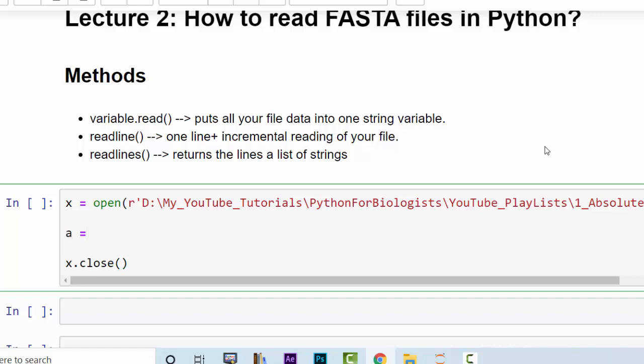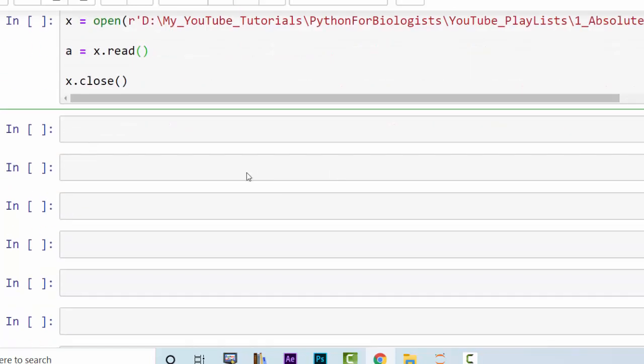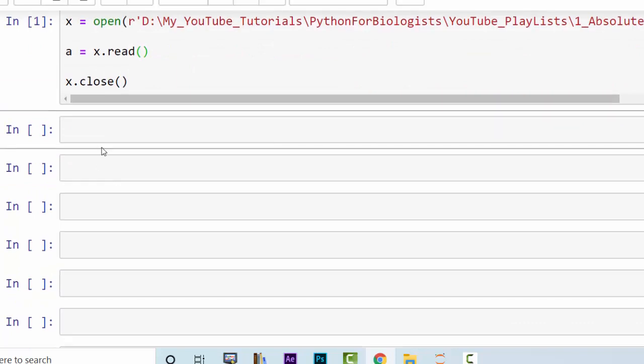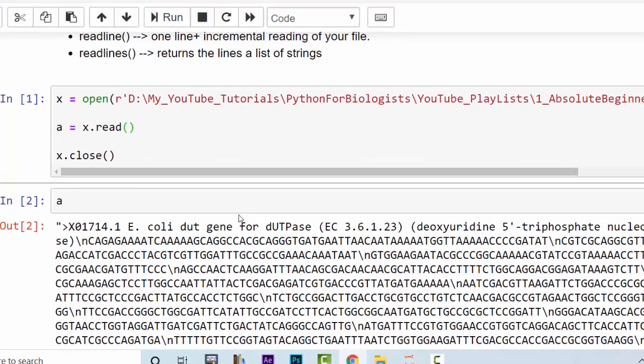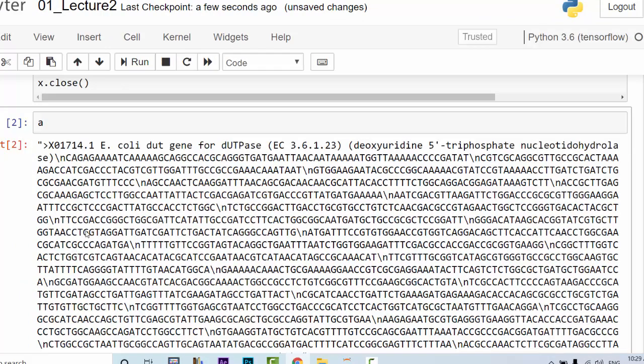Now in between you write down code. So a is equal to x dot read and that's what we need. This is the first thing that you do: you open the file, you read it, you close it. Now run this code. Hold Ctrl and press Enter or hold Shift and press Enter. Now if it doesn't return an error it means that everything went smoothly. Now once we read the file you can print it out. Well, this gives you an output.